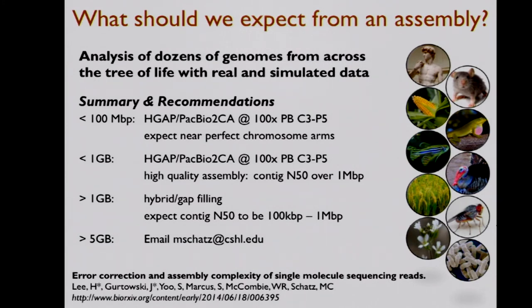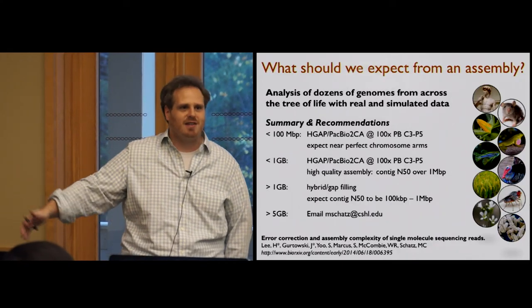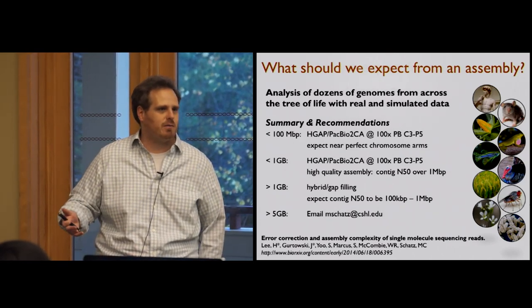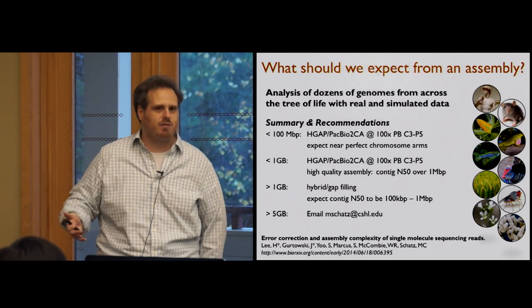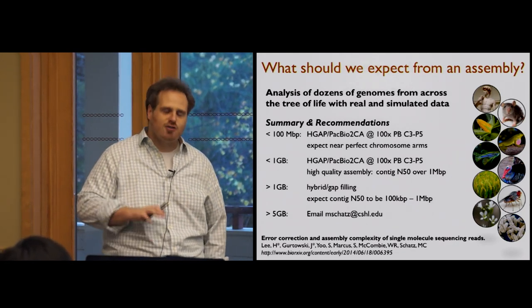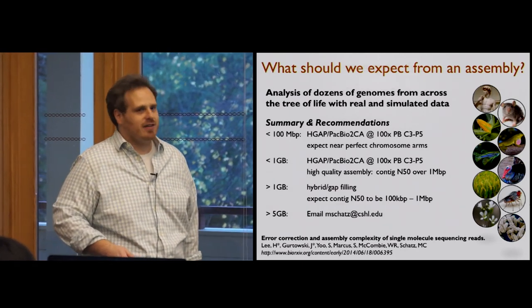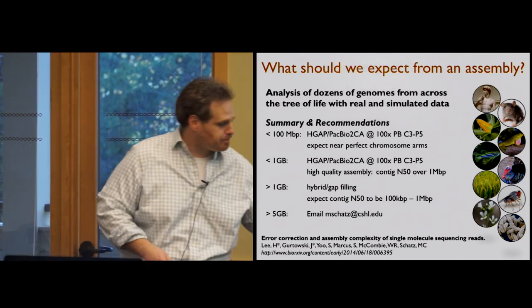I know you guys have also talked about nanopore sequencing. I have a whole separate talk about that. We've been very active with that. We have hybrid error correction strategies, very much like I described today. The challenge is the throughput is just not there. So we've been able to get perfect assemblies of yeast, but if you wanted to scale up to sequence a human, it would take like a year of sequencing and hundreds of thousands of dollars just because of the throughput. We look forward to the fast mode and we look forward to the PromethION that should make this more competitive, but just to set your expectations, it's a super cool technology. I love being able to show off having a sequencer in my pocket, but the reality is it's just not practical for large genomes today.